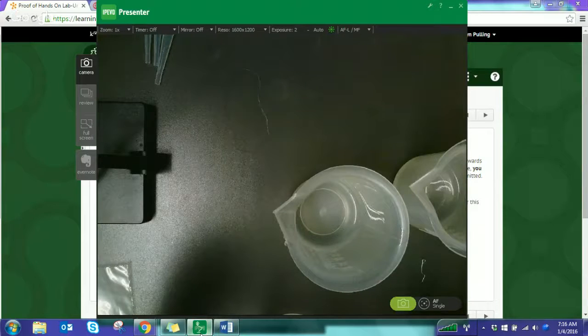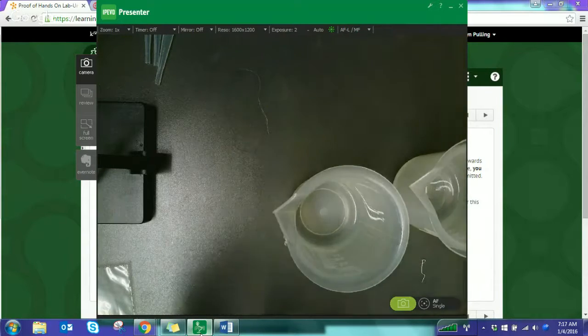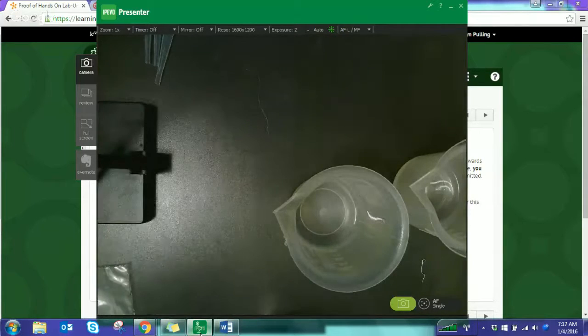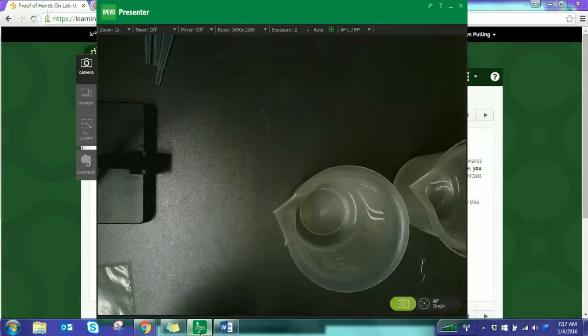One thing, since these are your kits, err on the side of conserving what you have versus using it all up, because once you run out, you run out.